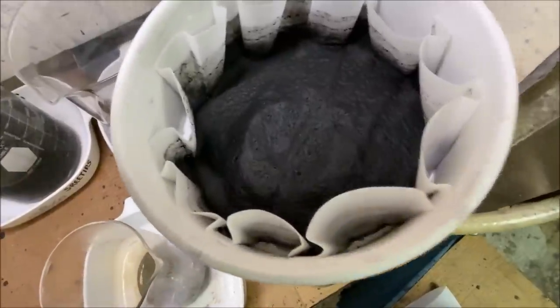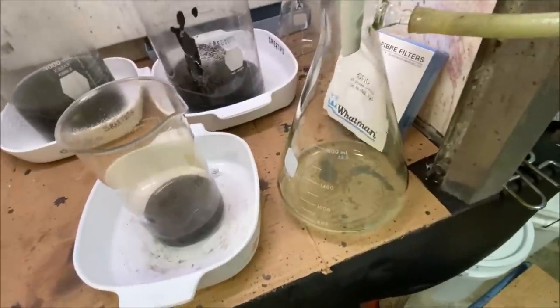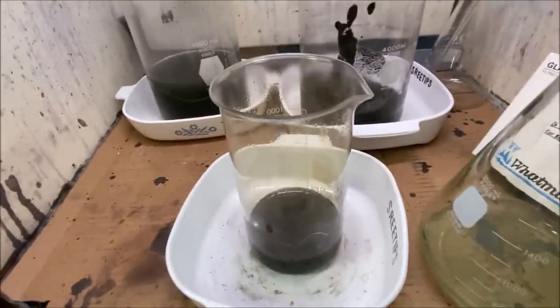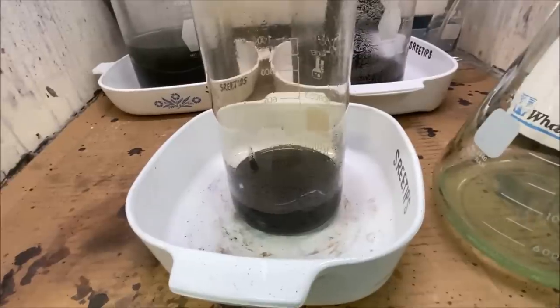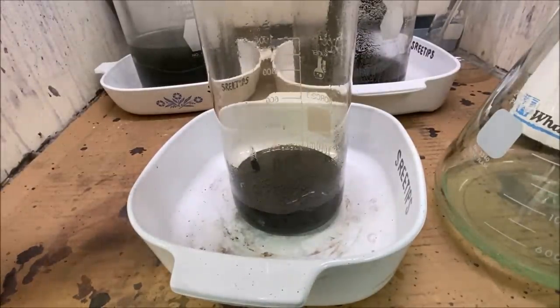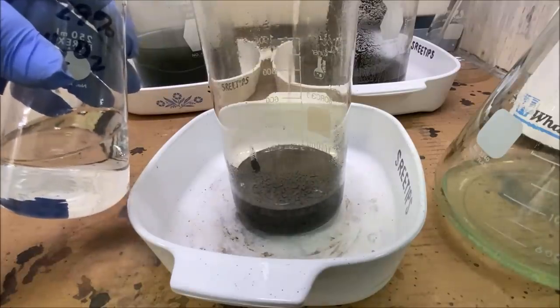All right, if you look here, our solids are nice and dry in that filter. It's pulled through quickly. It only took about 5 minutes to get all that solution pulled through there. So this is apparently going to be beneficial for us. I'm going to keep adding some hydrogen peroxide here.